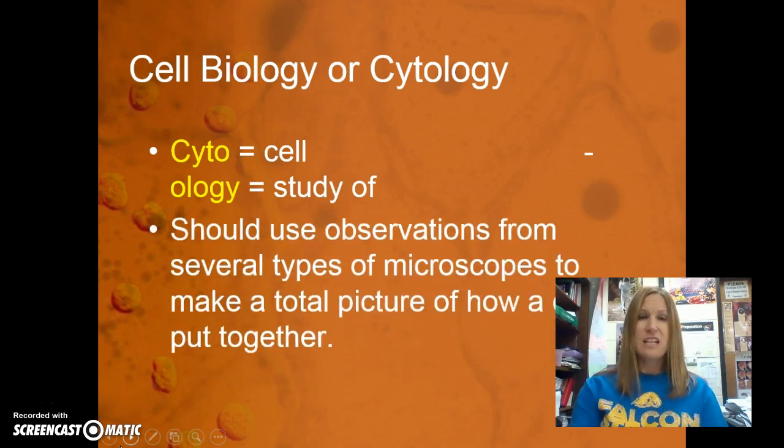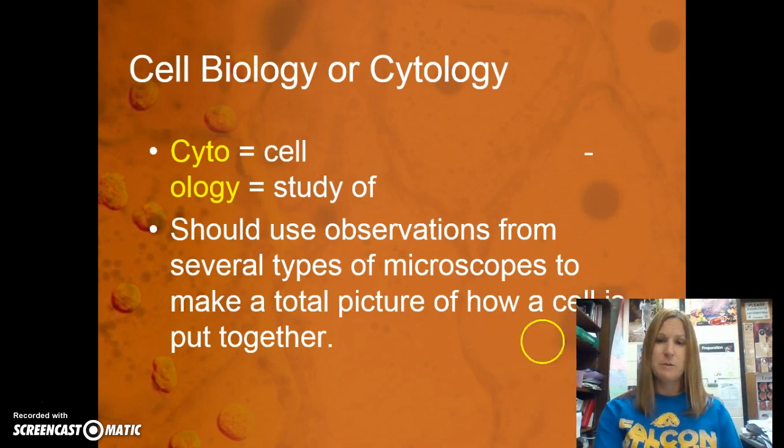For cytology, we use observations from several types of microscopes. So we're going to talk about those different types of microscopes so we can gather a total picture of how that cell is put together.